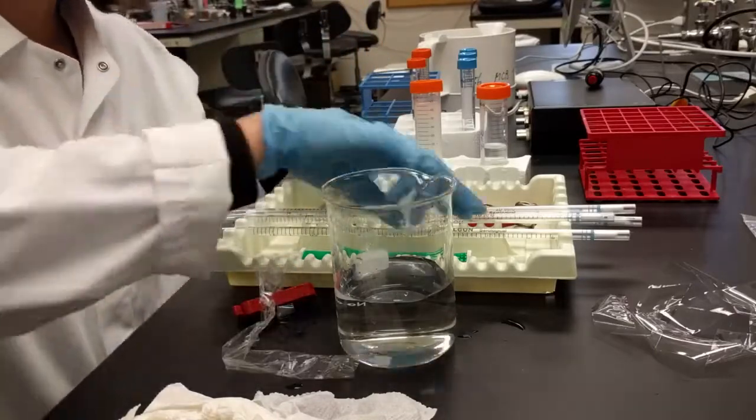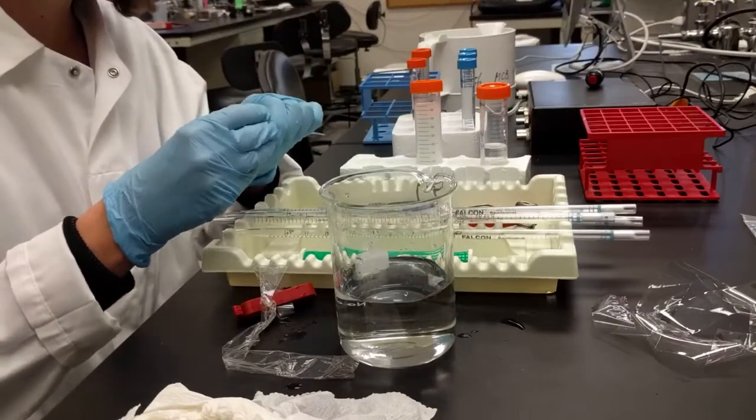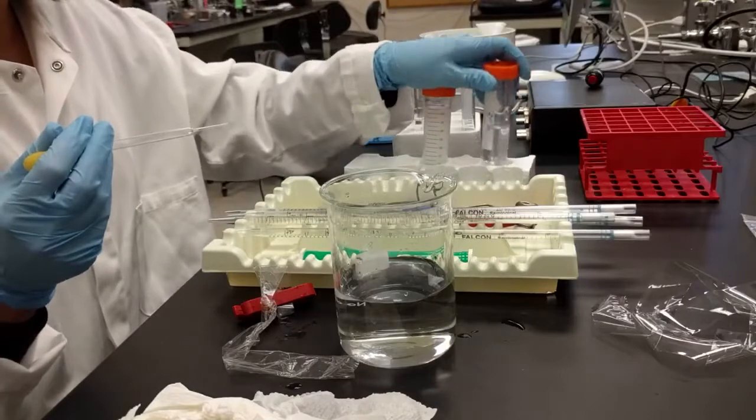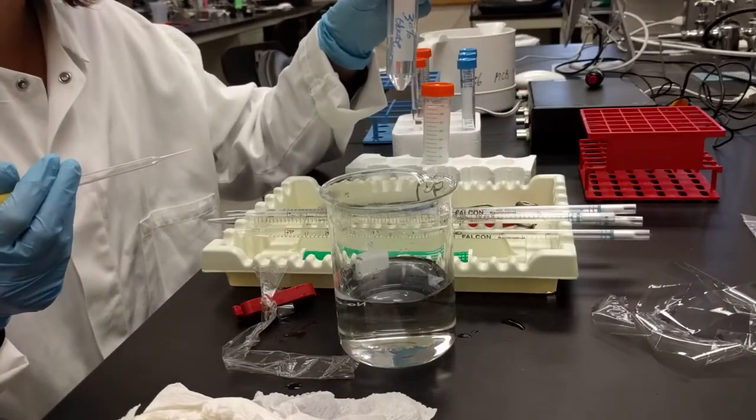Okay, so next up, I'm gonna get a glass pipette, put the bulb on it, and I'm gonna put in about 4 pipettefuls of the 30% glucose.